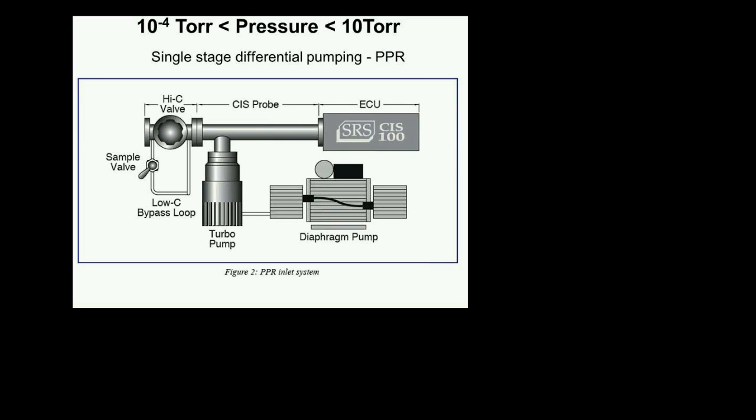In that case, what you're going to need to buy is not just an RGA itself, but you're going to have to either buy or put together a differentially pumped system, which is going to connect to your application system, to whatever your process is, and then through a valve, on an aperture, it's going to connect to another chamber which has its own dedicated turbo pump system and the RGA in it.